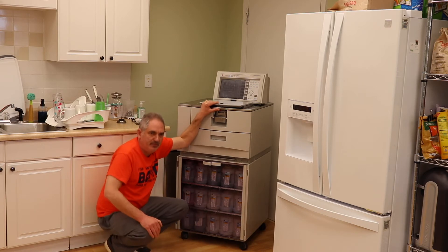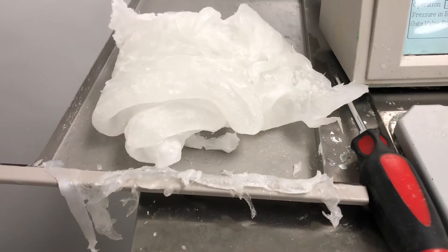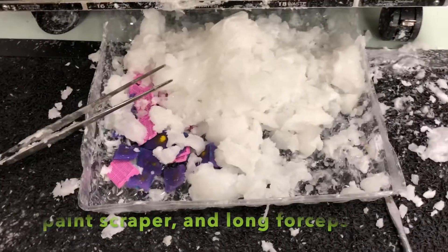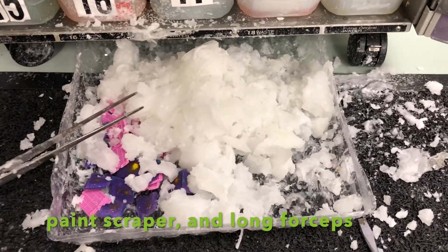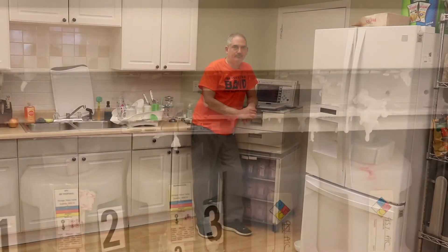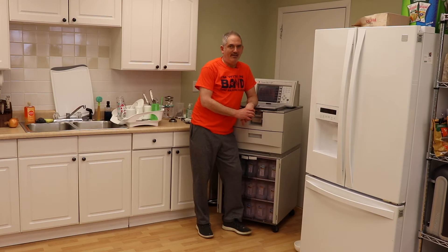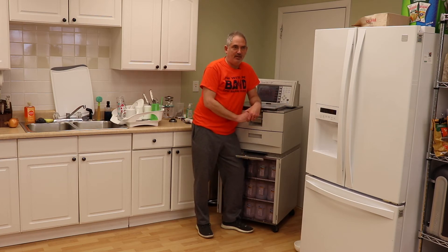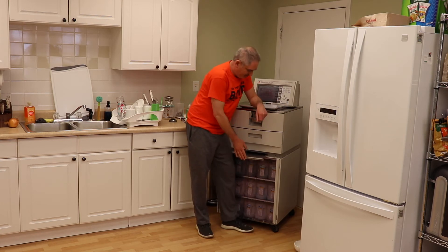That particular machine actually had a very serious paraffin leak, so you probably won't see anything like that. But you still need to pull these out maybe once a week and clean them up with a paint scraper or something, then put them back in.